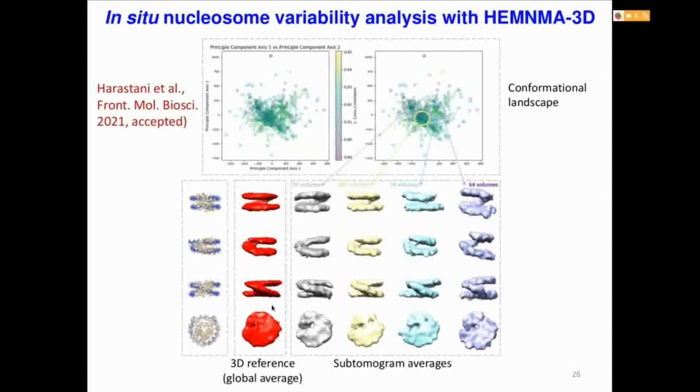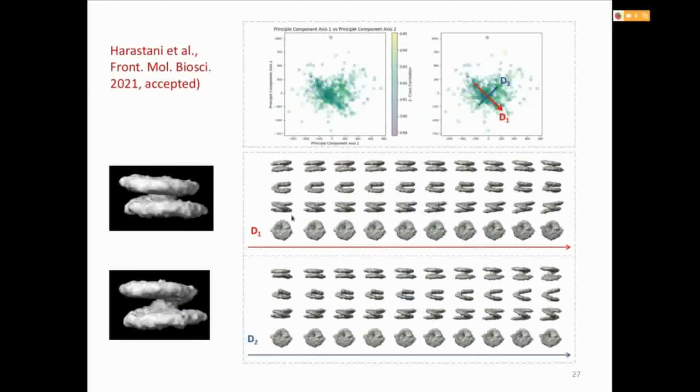So we use the first 5 lowest frequency, highest collectivity modes, which means those for which the collectivity was above 0.5, and these 5 already included these 2 modes that I was mentioning, breathing and gapping. We included one 6th mode that was a little bit higher and looked interesting, but in the end, with this data we could mostly see breathing and gapping in the final averages and even in the movies.